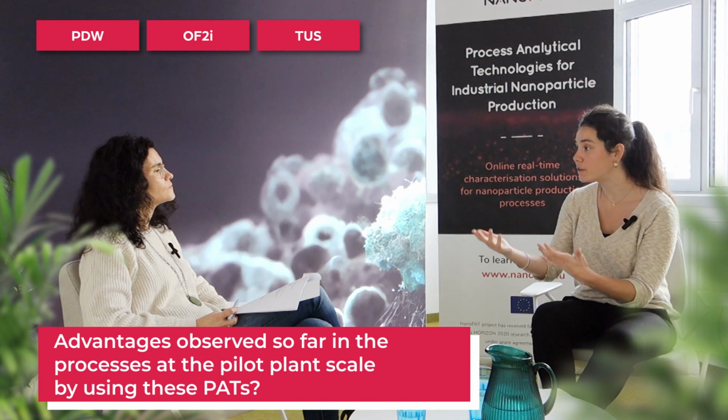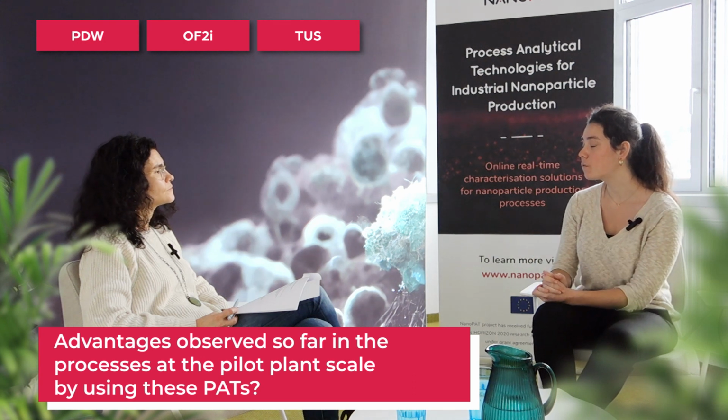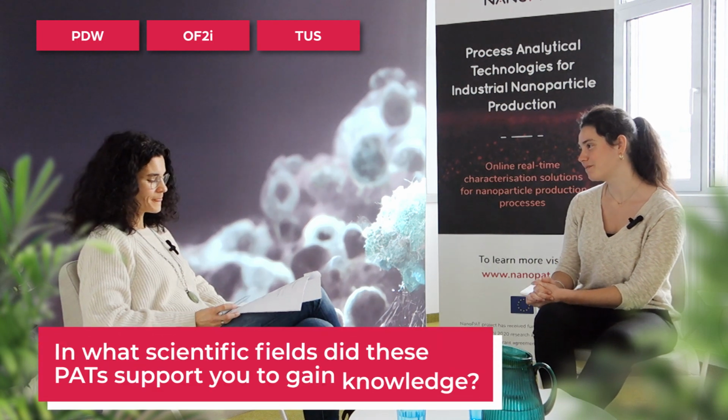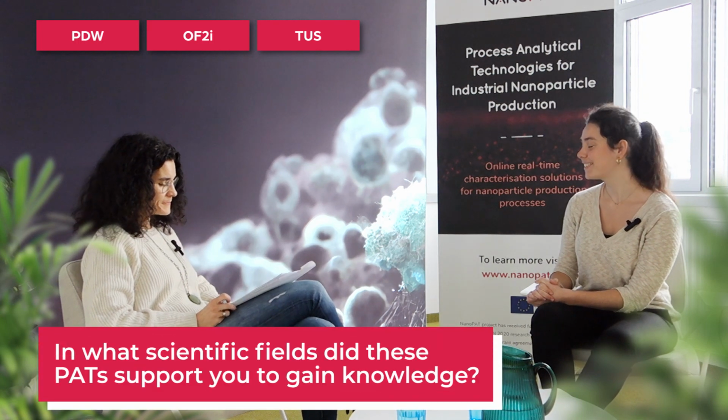But in the emulsion polymerization processes, the ones that we are working with, this is very challenging because the particle size and the solid contents are changing together. So having this automatic selection, it's a really positive thing. It sounds very promising. Yeah.